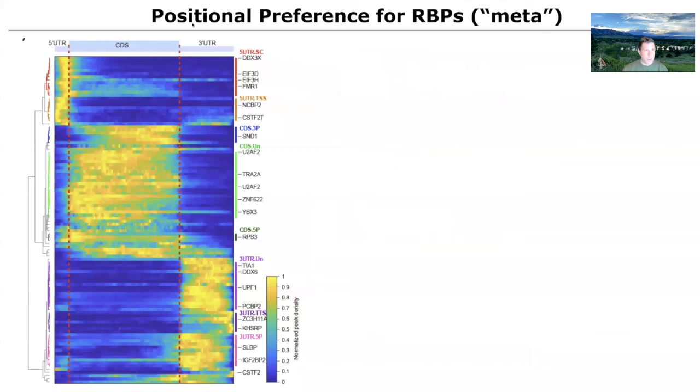Here's another way to positionally reference, and we've already started to do this with our ChIP data, where we've said, well, let's look at just the promoter and the gene body. And we can also get the UTR of a gene if we wanted as well. And just to show that this works for not only ChIP, which is asking which pieces of DNA a protein is bound to, but CLIP is used for finding the RNAs that an RNA binding protein is bound to, which is essentially equivalent to what we're doing. And we will make plots like this as well.